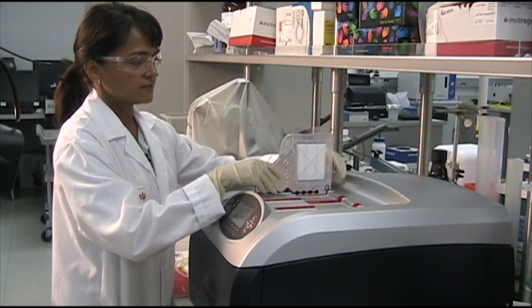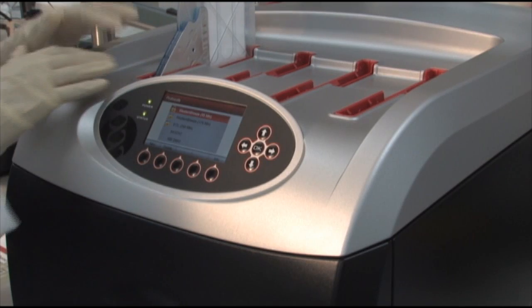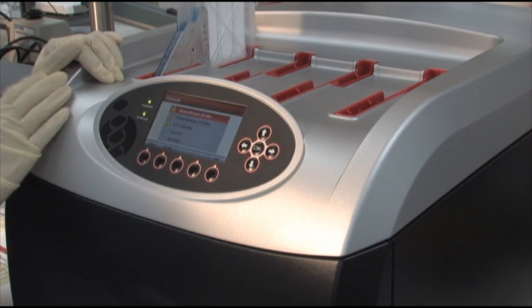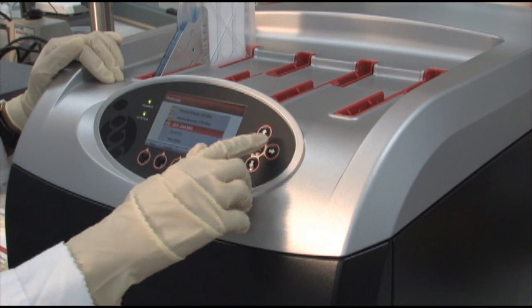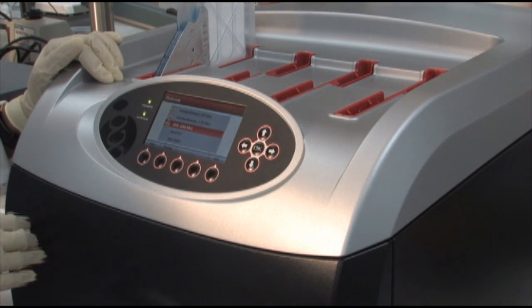You would load your blot, insert it into the card in one of the slots. Then simply pick one of the programs and hit OK. That's it.